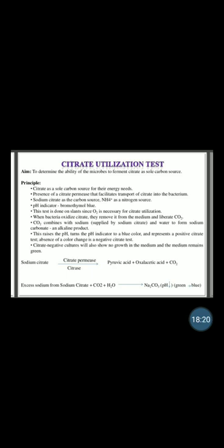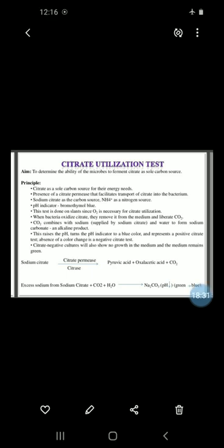This raises the pH and turns the pH indicator to blue color, representing a positive citrate test. In the absence of color change, it shows a negative citrate test.